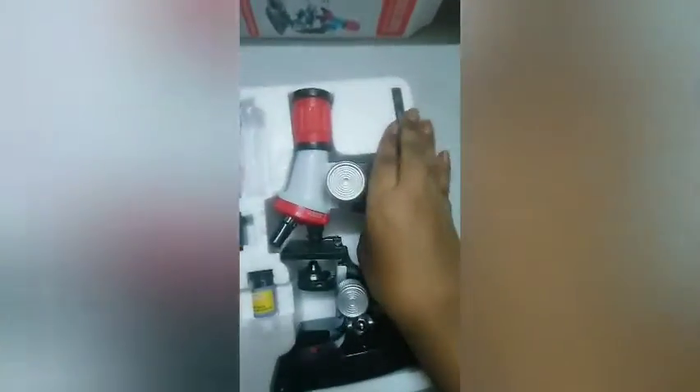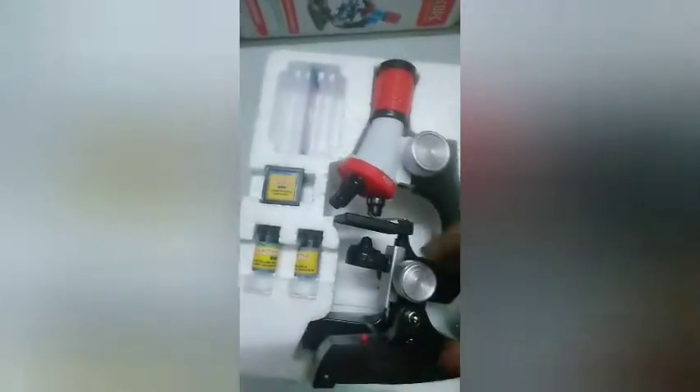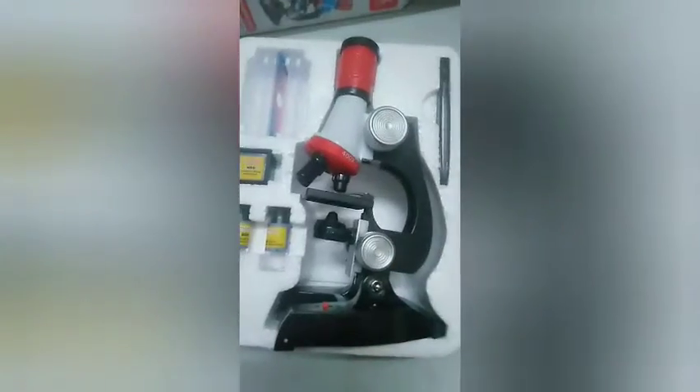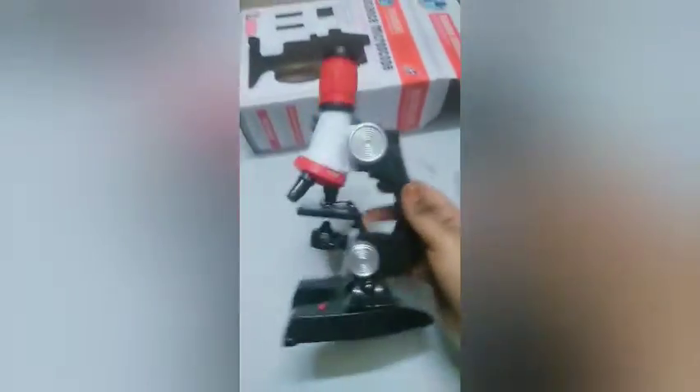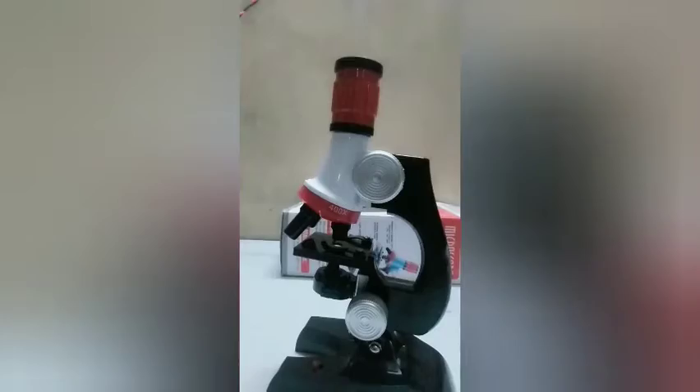I just take it out. It is a little difficult taking it with one hand. As I mentioned in a previous video, I am taking the video holding the camera in my hand, so it is a little difficult. We have taken this out — it is very lightweight, very light indeed. You can see this is our microscope.